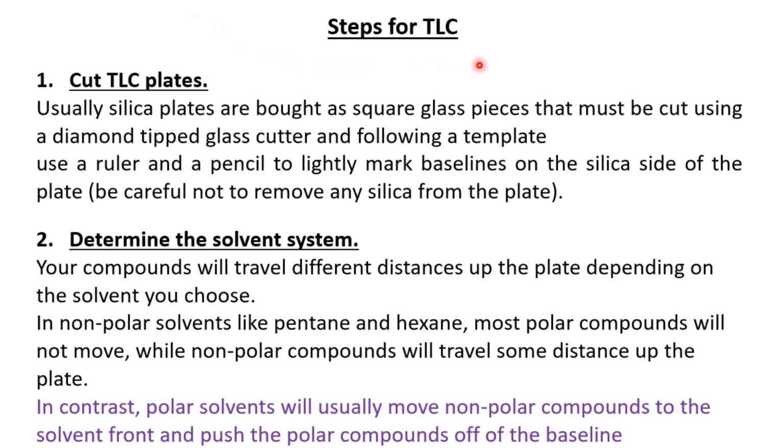Okay, so before you run your samples, you can prepare the plates yourself. You can cut them into the sizes that will best suit the work you are going to do or the number of spots you want to spot at a given time on the plate. And then of course you will go ahead to determine the solvent system you use.